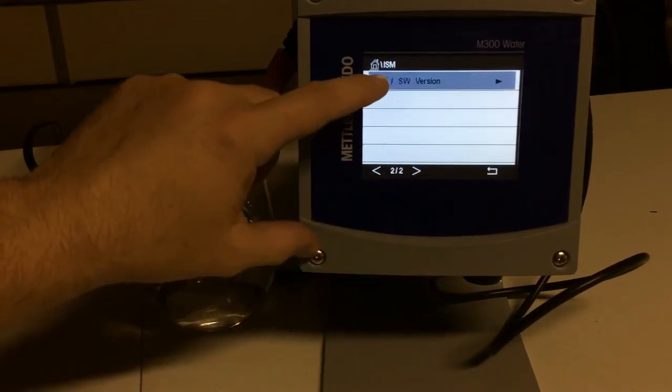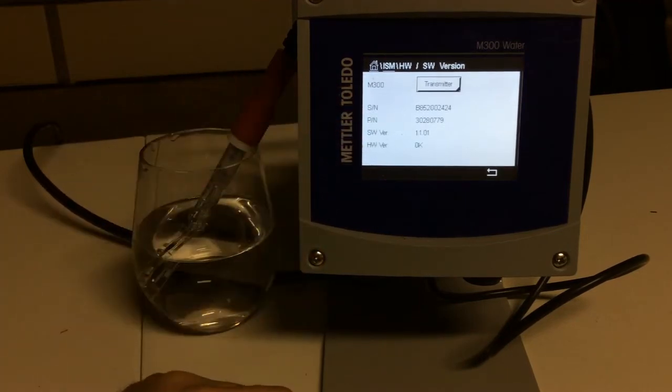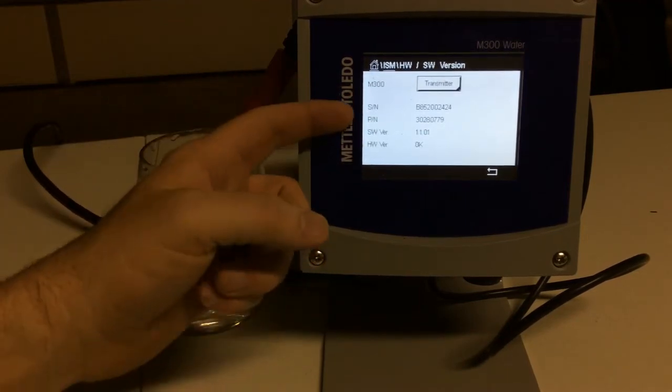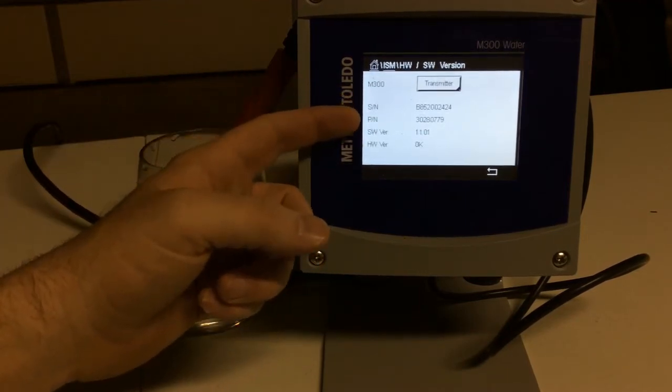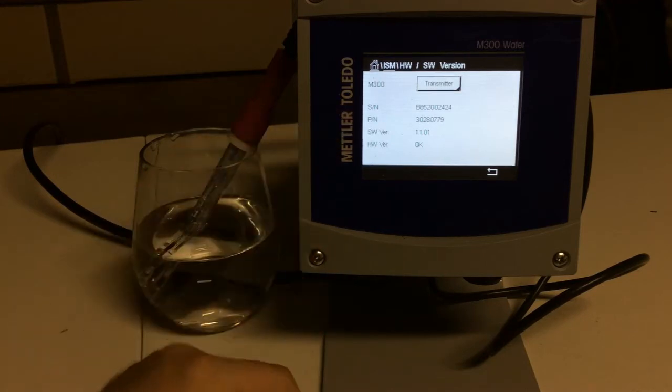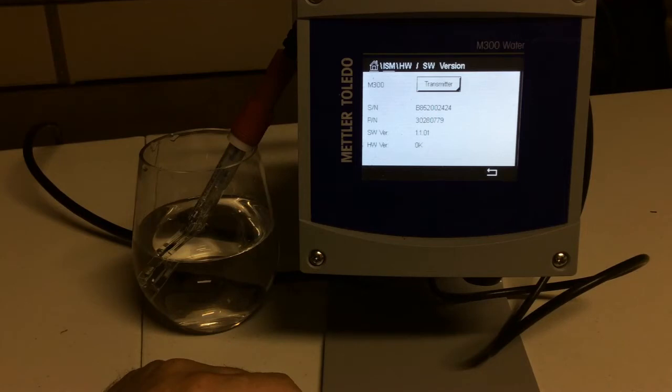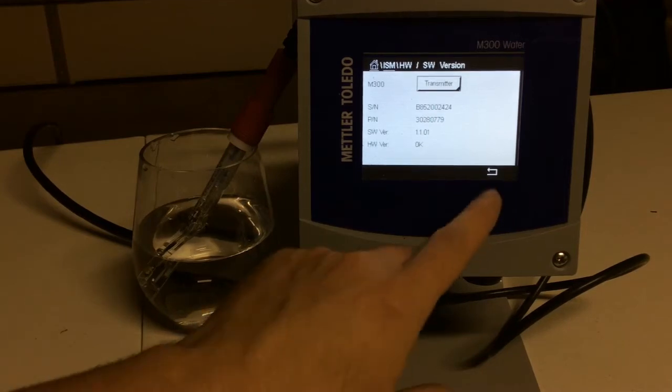Same thing with our hardware. So this transmitter, if you needed to add another one, here you go, there's our serial number, there's our part number. Call me up and say, Joel, I need to order 30280779, and I'll get that ordered for you.